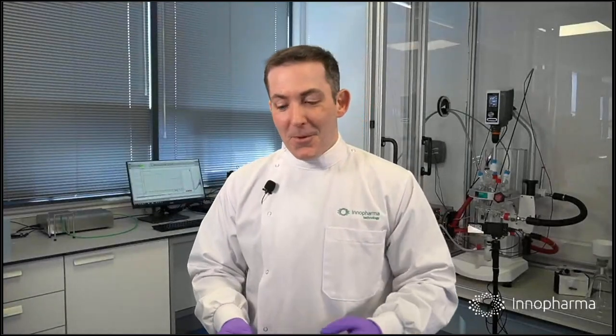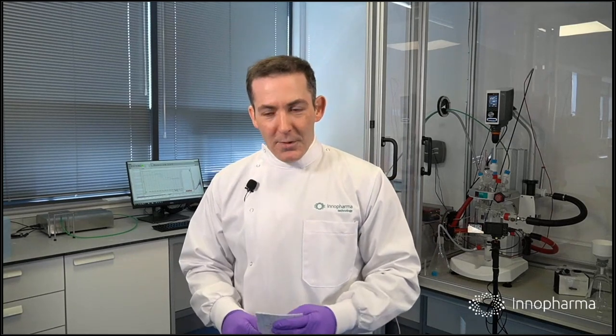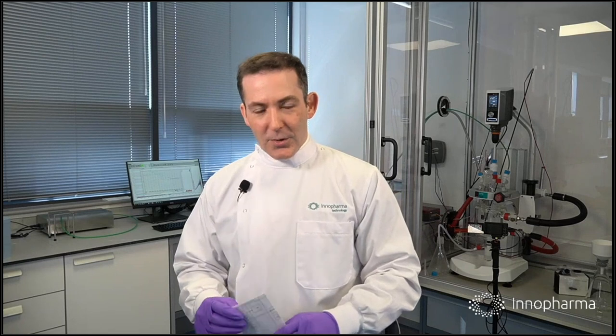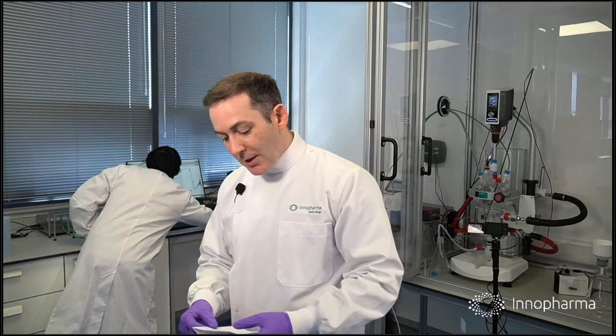But for some processes, particularly for processes where you need to know that you've processed to a specific concentration, the only way is to use chemometrics with your process analytical technology, where you convert the signal into concentration or other information.